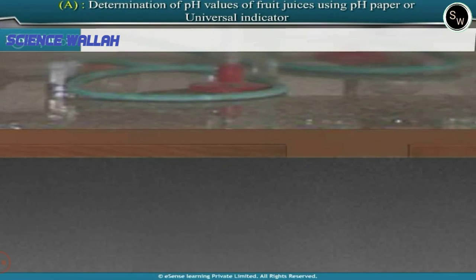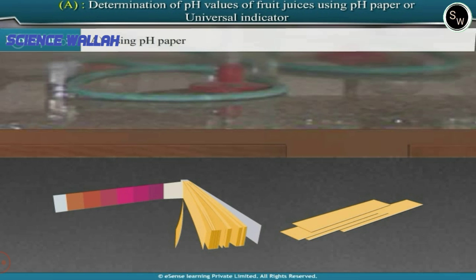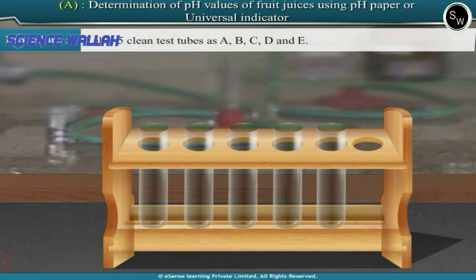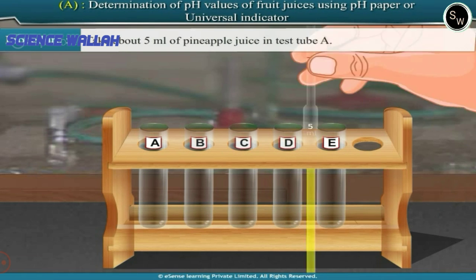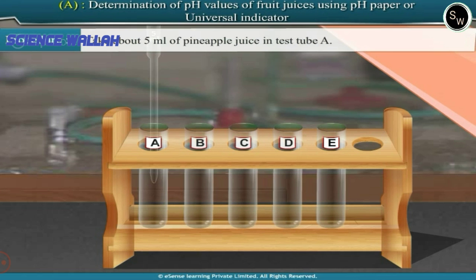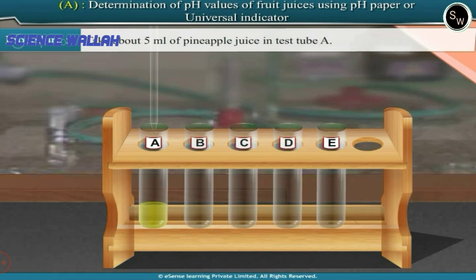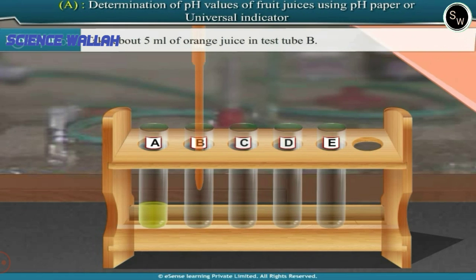Let us perform the experiment. Part A: Using pH paper. Label five clean test tubes as A, B, C, D, and E. Take about 5 ml of pineapple juice in test tube A. Take about 5 ml of orange juice in test tube B.